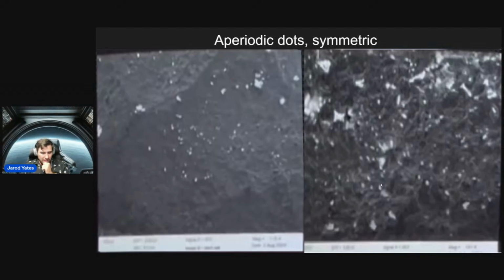The zinc-lead microspheres and their arrangements: if there's one thing you can take away from all of this as to why this sample deserves people's attention, it's that. Why do we have zinc-lead microspheres that happen to rupture in weird ways, that happen to be arranged in these specific arrangements on this piece of supposed slag?